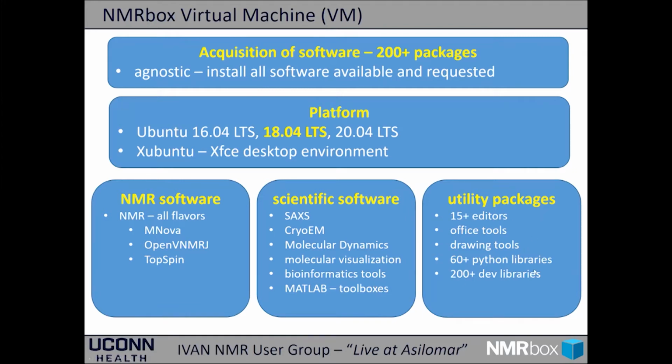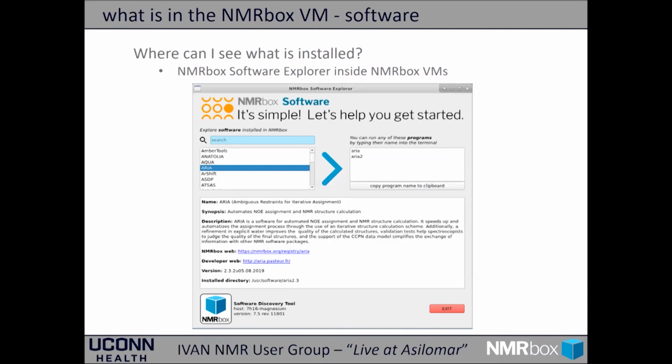Lots of other utility packages, text editors, office tools, drawing tools. And more recently, we've been making a major emphasis to try to include as many development libraries, Python libraries, and just other development libraries. So people who are doing their development on NMRbox generally will be able to compile programs without having to install additional packages.